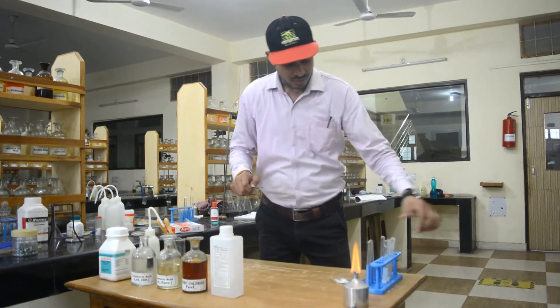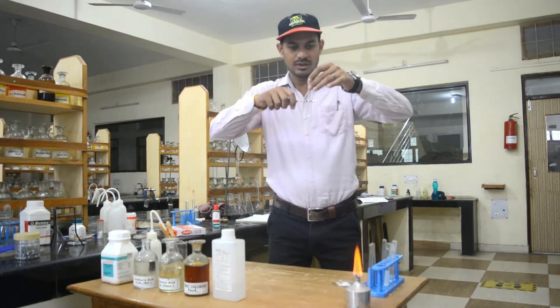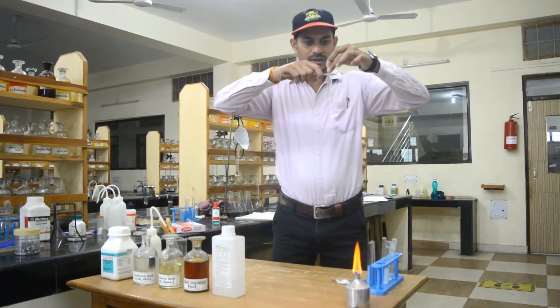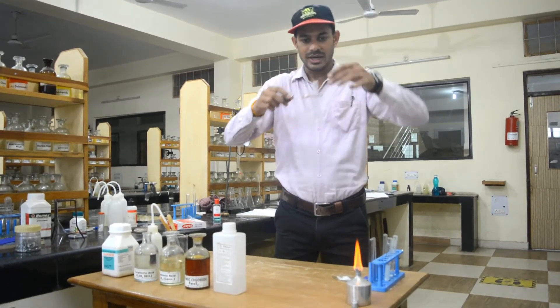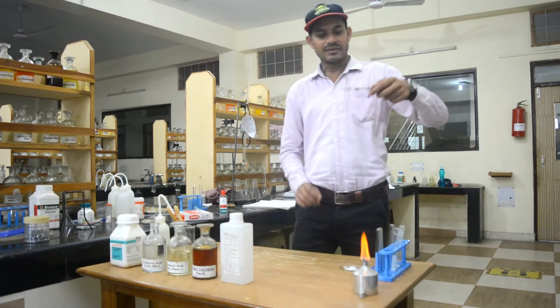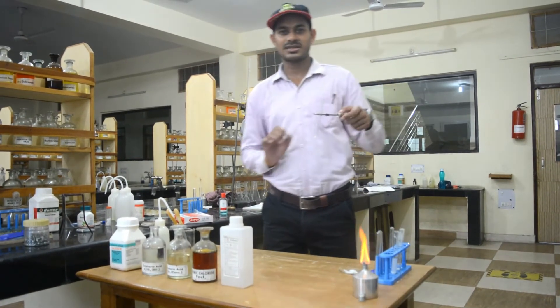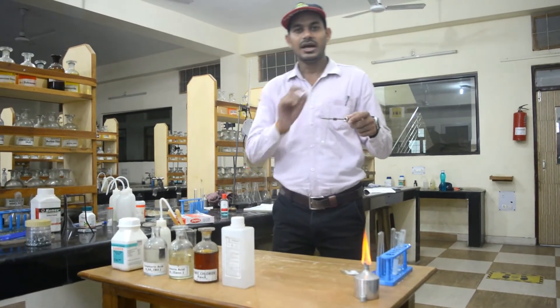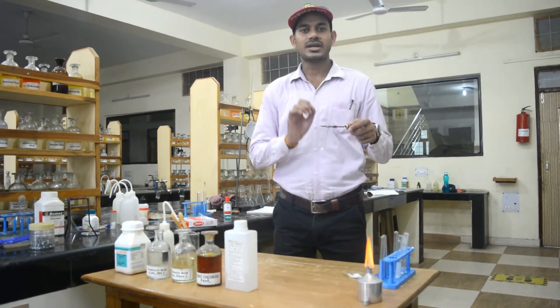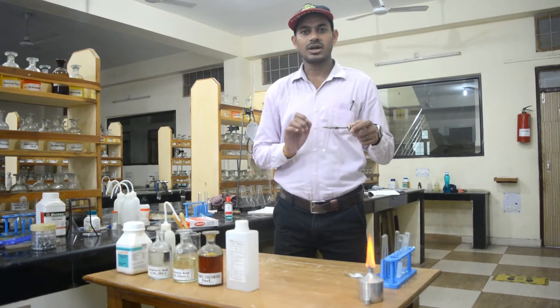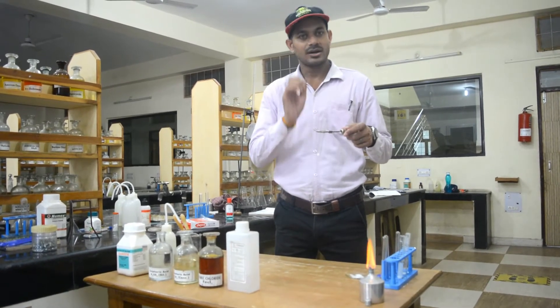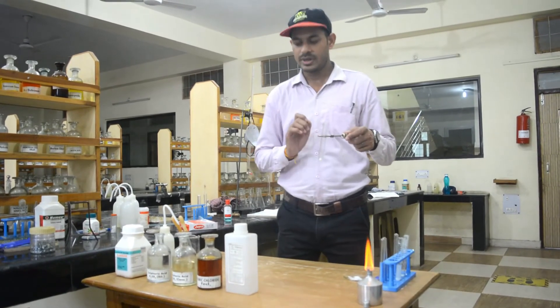In another test tube I have taken the salt again. Now in this I will add concentrated sulfuric acid and ethyl alcohol. This test is called the esterification test, which you have all read about earlier.